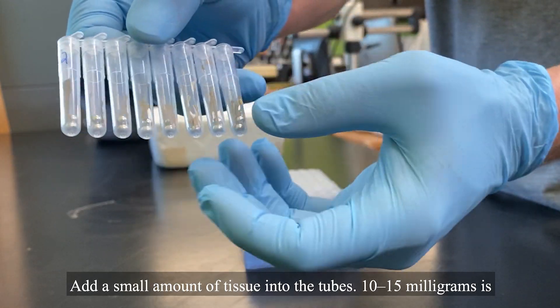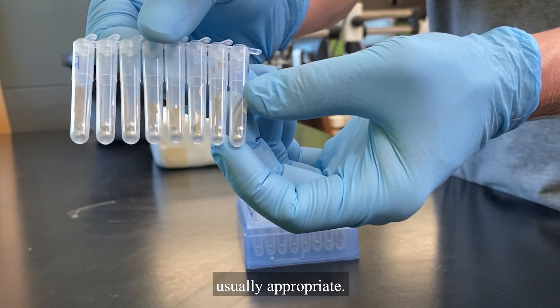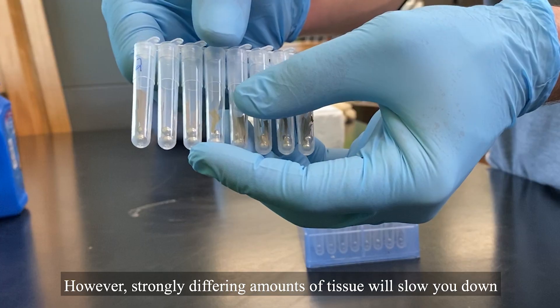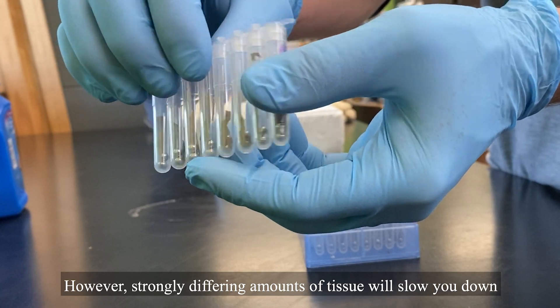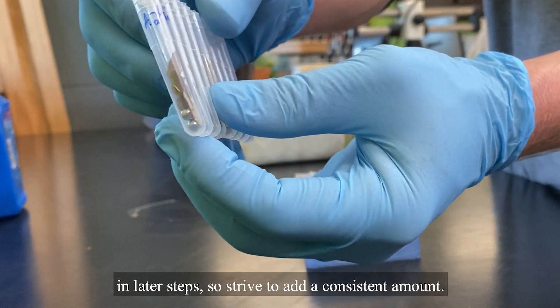Add a small amount of tissue into the tubes. 10-15 milligrams is usually appropriate. Don't weigh every one, just weigh one as an example and eyeball the rest. However, strongly differing amounts of tissue will slow you down in later steps, so strive to add a consistent amount.